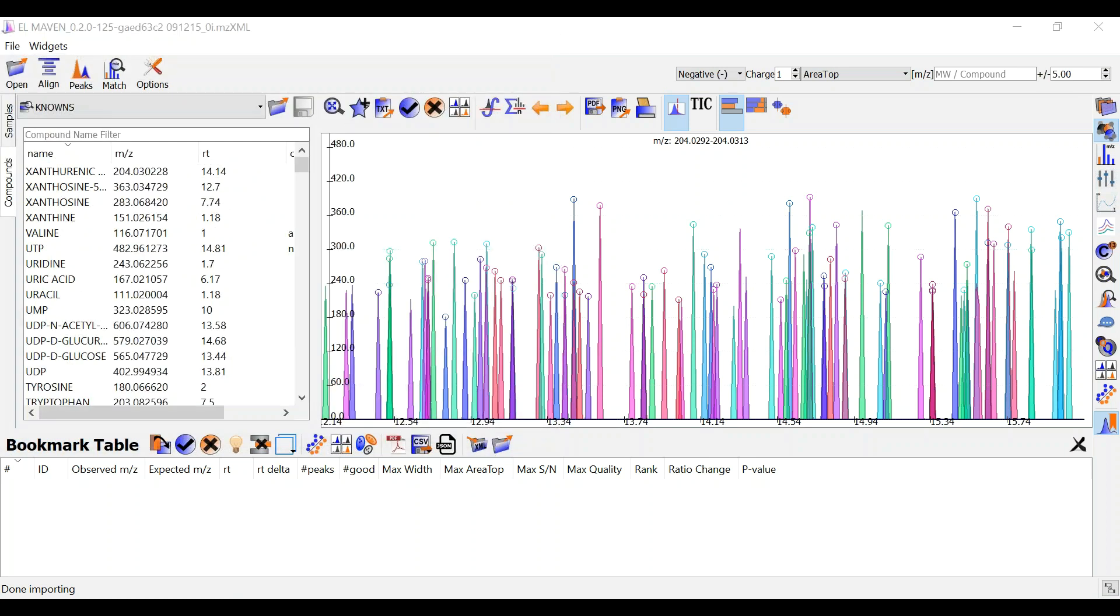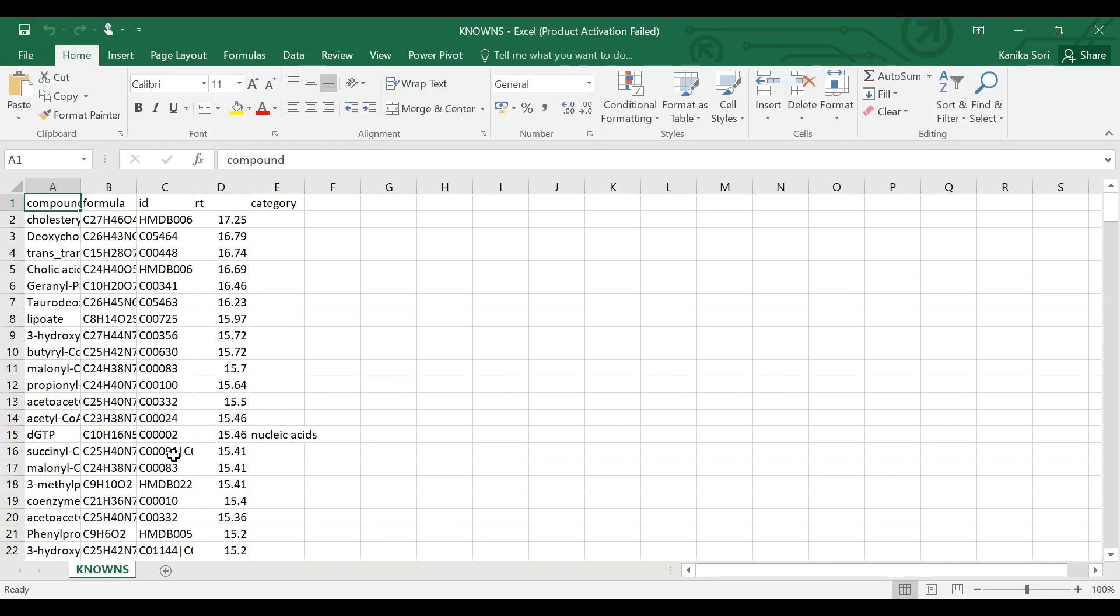This is a sample compound database. It has compound formula, id, rt and category columns.